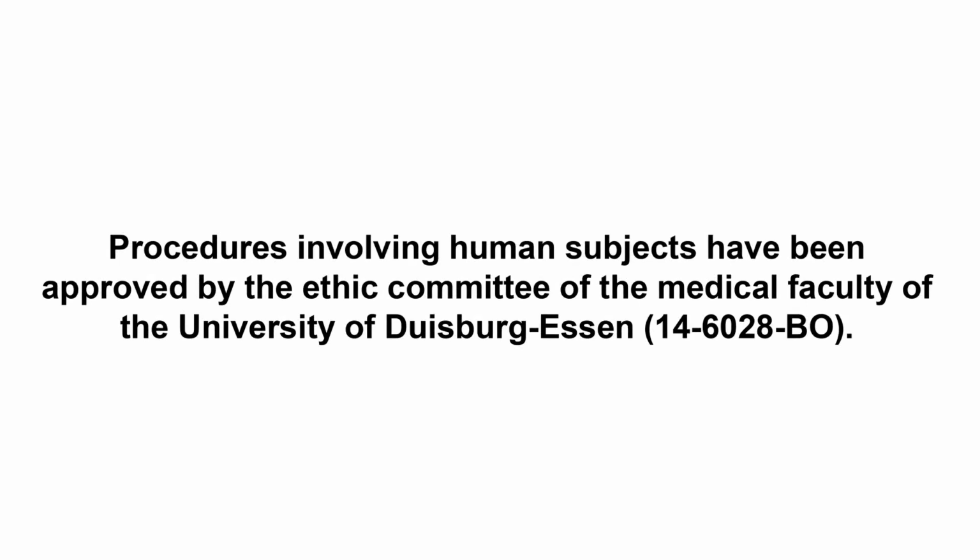This protocol follows the guidelines of human research as approved by the Ethics Committee of the Medical Faculty of the University of Duisburg-Essen.